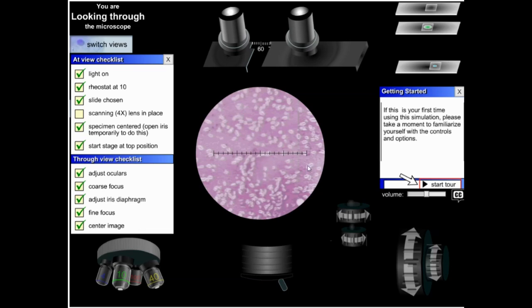And this one is a good image here. So on the inside is the bacterium, and this is the capsule part. So these pieces that are barely visible, that's what you're looking for. So keep in mind, you're at 1,000x here, right? And you're barely going, am I really seeing what I'm supposed to be seeing? And that's the experience I want you to have. That's the experience you don't have unless you're trying to look at a microscope.